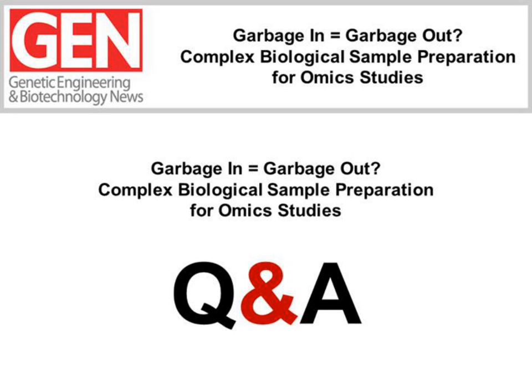Yes, customers did. There was a poster at one of the conferences in Rome a couple months ago. The challenge to analyze extracellular vesicles is that usually they are co-purifying with albumin, regardless if the purification is attempted from the cell culture media or any of the body fluids, including urine. So since Direct Detect is seeing total protein, whatever protein is co-purifying with the extracellular vesicle will also be quantified.